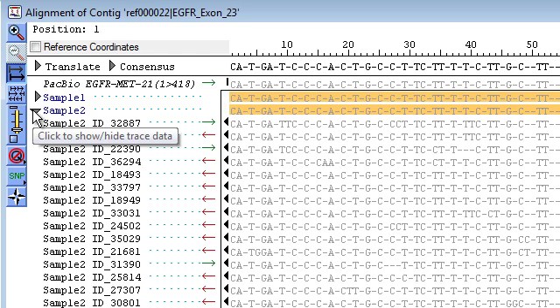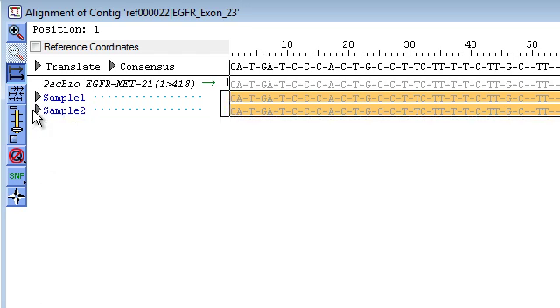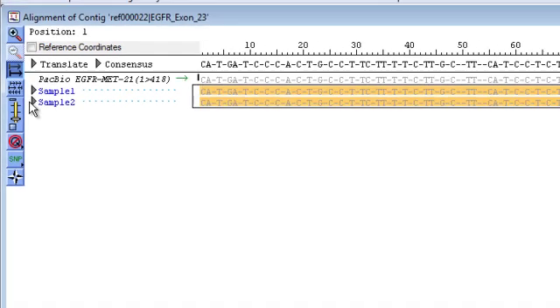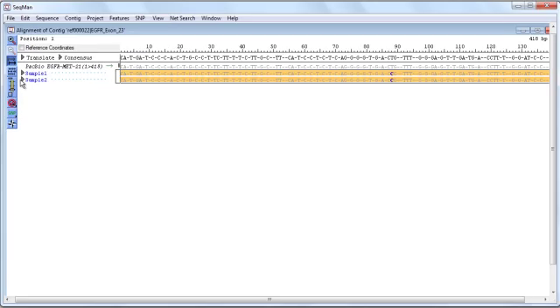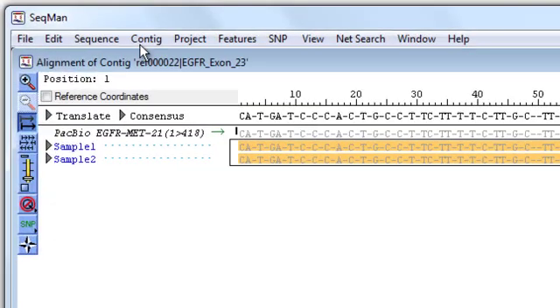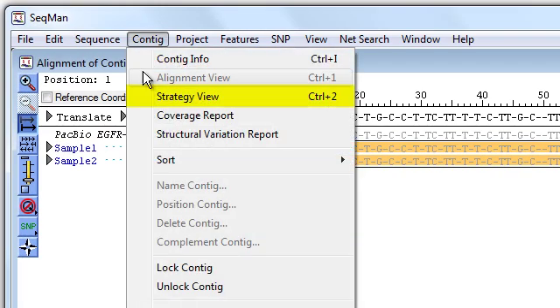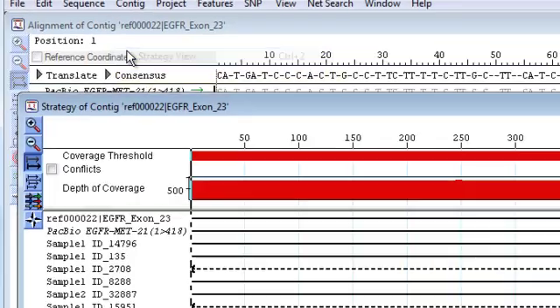And if I want to hide those, I just click the arrow again. And now I can compare the consensus sequence for each sample to my reference sequence. To see a graphical representation of the assembly for this contig, I select Contig Strategy View.